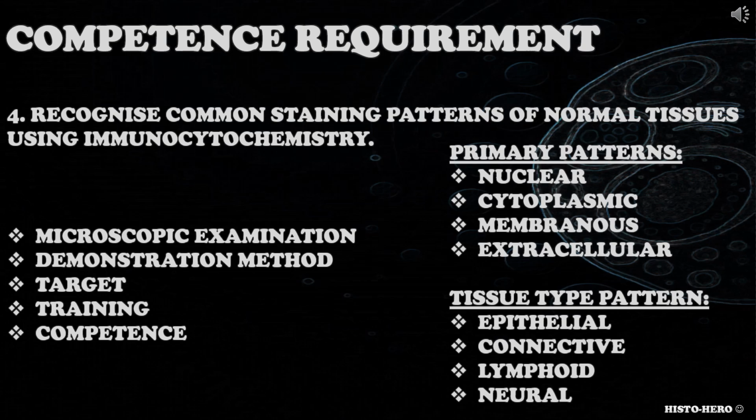When addressing this competence requirement, candidate could consider correct microscope setup and use, demonstration method used and the target element they highlight, their training and competence, primary expression patterns like nuclear, cytoplasmic or membranous, tissue type pattern like epithelial, connective, neural or lymphoid tissues.